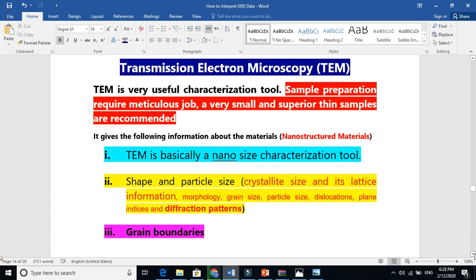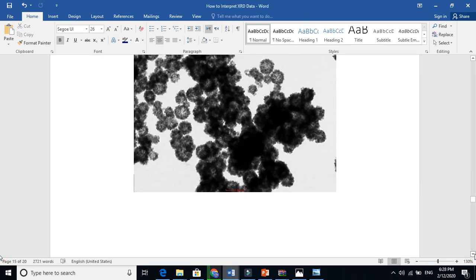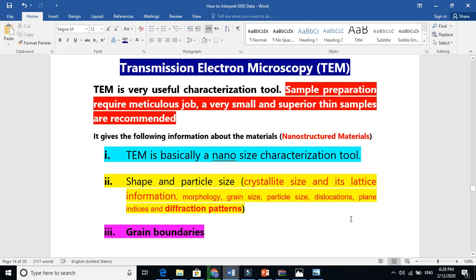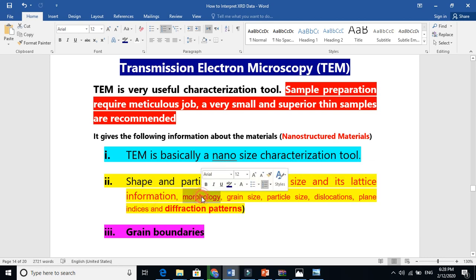Transmission Electron Microscope images are shown here. The sole purpose of TEM is characterizing nanostructure material, particularly at the nanoscale. So TEM is basically a nano-size characterization tool. What we find about the material includes its shape and particle size — for example, the crystallite size, lattice information, and morphology.